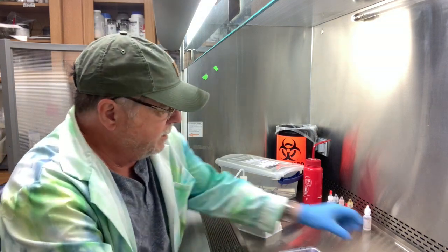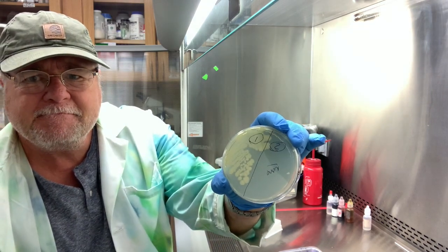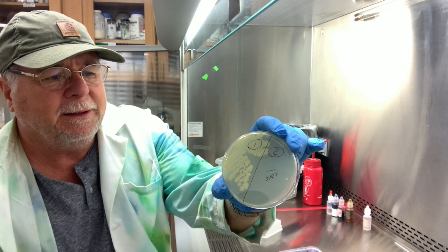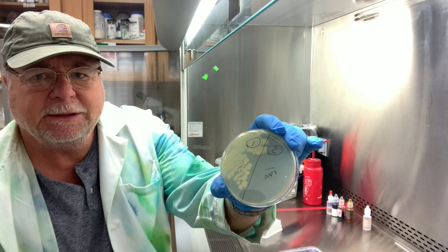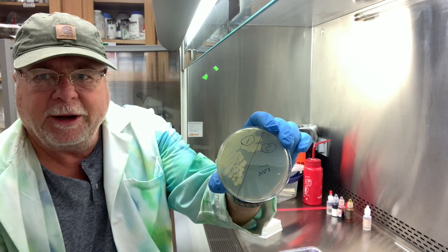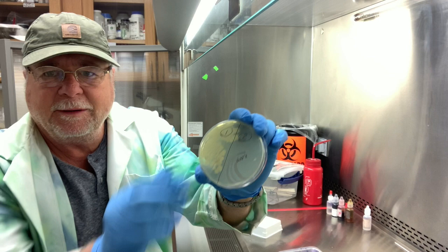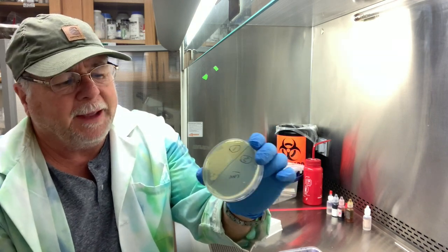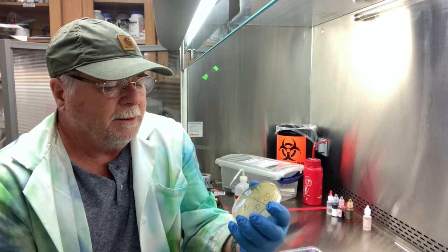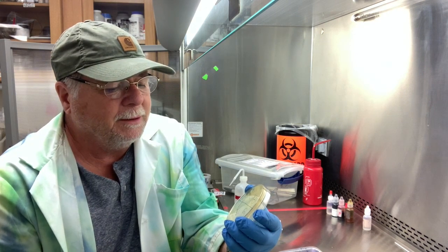Alright, so we're going to work with E. coli. I did a streak plate of these last Wednesday, or 2 days ago, and then we incubated them at 35 degrees Celsius. This is TS agar, so tryptic soy is the recipe, and then we added agar. So this is a TS agar plate that we added our bacteria on. A TS agar plate is a standard plate. It's kind of a rich media, so it has lots of nutrients for bacteria to grow.